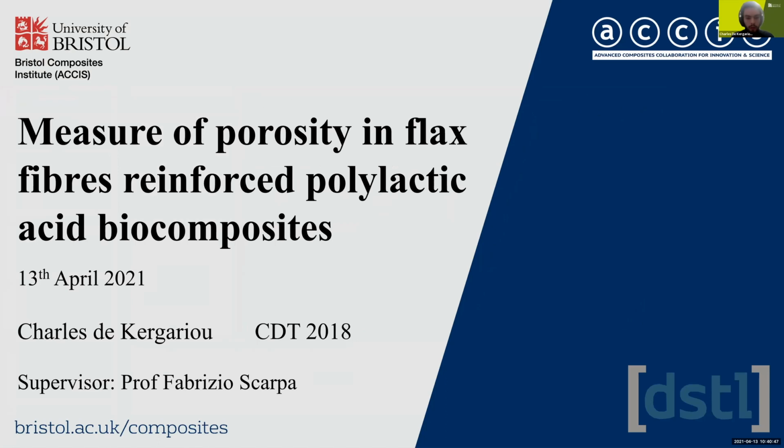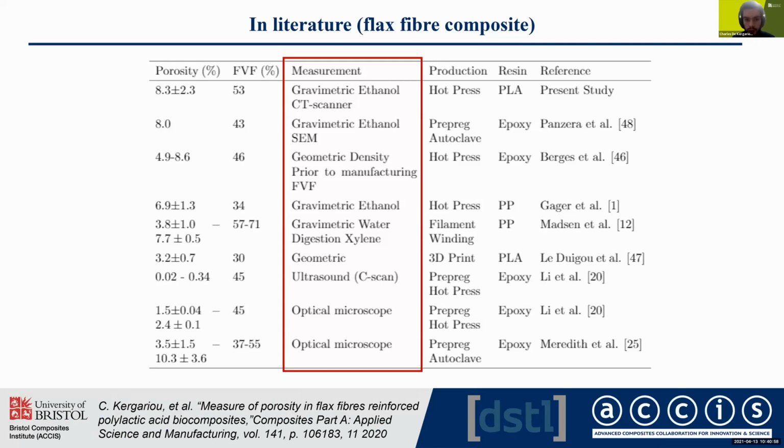I'm supervised by Professor Fabrizio Scarpa, and I'll be talking today about the measure of porosity in flax fiber reinforced polylactic acid biocomposites. When I started working on this material, I wondered how I could assess the quality of my composites. In order to do this, I looked at the literature at all the different techniques that are available to measure the porosity of these composites. You can see them in the red box. There are many of them, and so I wondered which one would be the best for my specific materials.